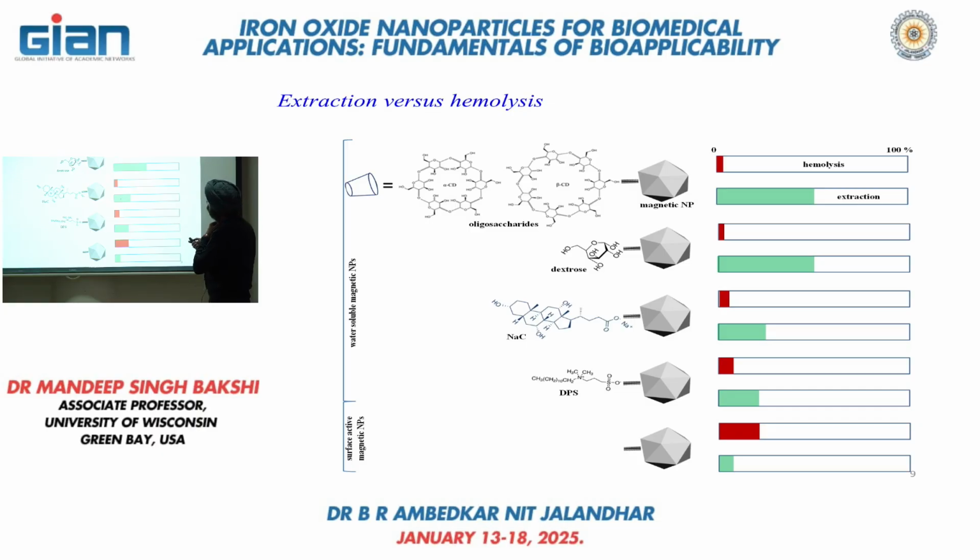For that, the effect is almost the same. Dextrose is also as useful as cyclodextrin. Biological surfactant, sodium cholate. This is sodium cholate. If you look at the internet, it's a cholesterol derivative, a biological surfactant, right? If you take sodium cholate, are they giving us any better results? There is still higher hemolysis in comparison to this, right? But the extraction is much less, 50% of this.